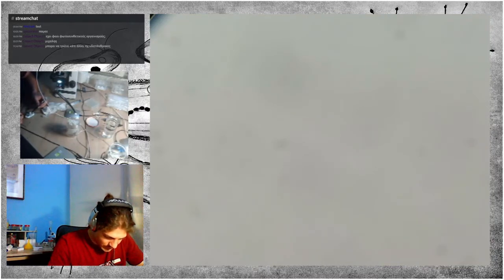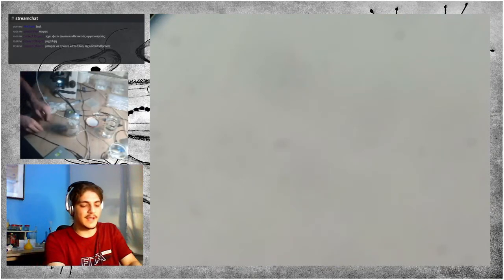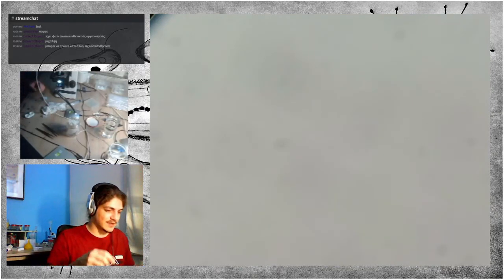Also, it is good to spread the solid material around the slide because it gets less obstructive, and also the slide gets thinner that way.